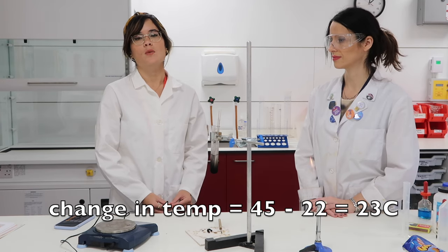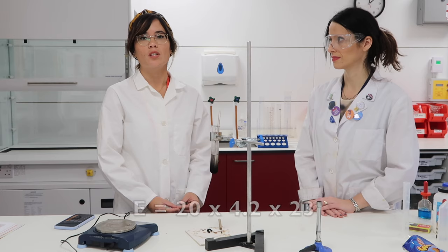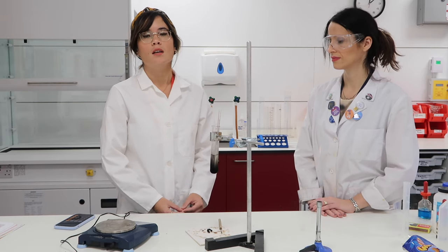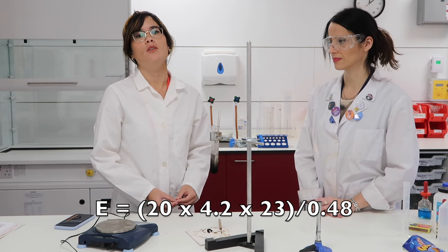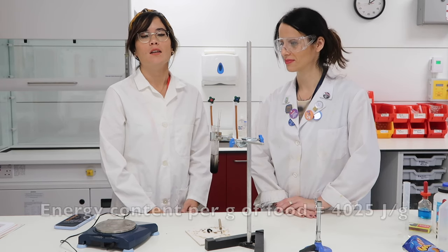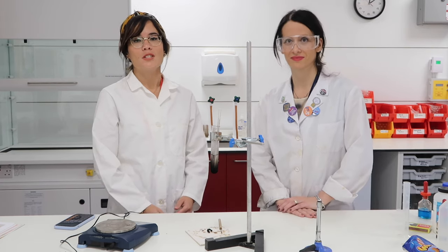Times the change in temperature — our final temperature was 45 degrees Celsius and our initial temperature was 22 degrees Celsius, so our change in temperature is 23 degrees Celsius. We do 20 times 4.2 times 23 to find the energy released. To find it per gram of food, you simply divide that number by the original mass of the food, which was 0.48 grams. Using a calculator, the energy content per gram of Wotsit is 4025 joules per gram — so make sure you can use that equation.